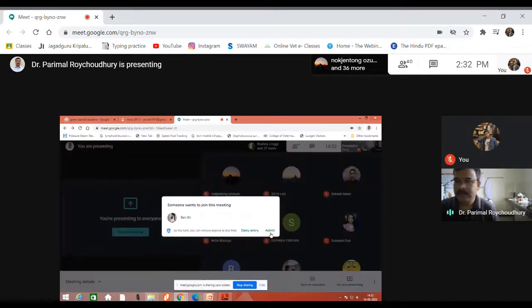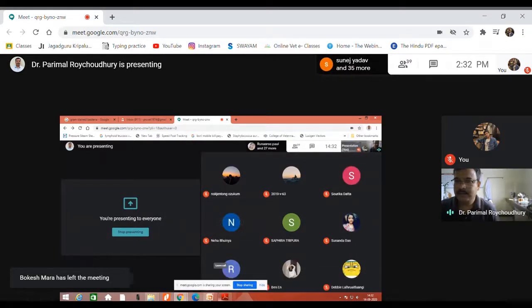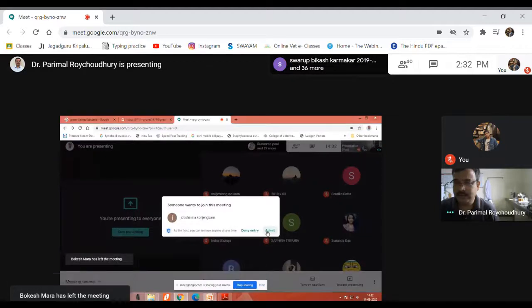So in this particular class, we are going to learn about these organisms, the stains and staining.